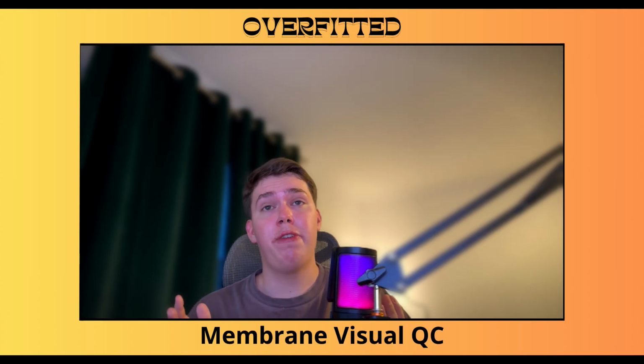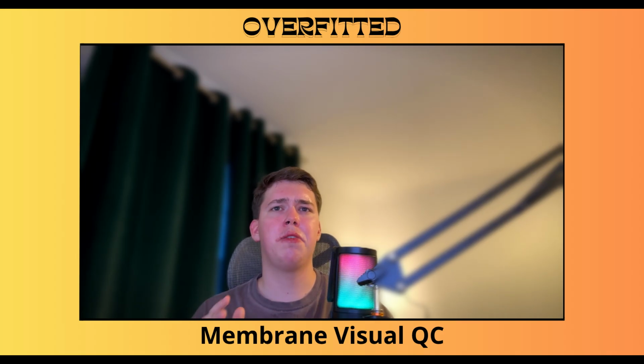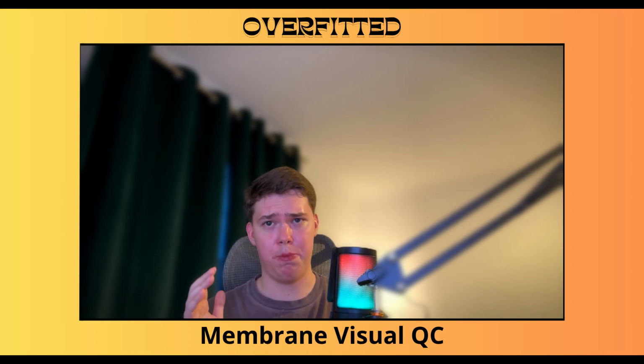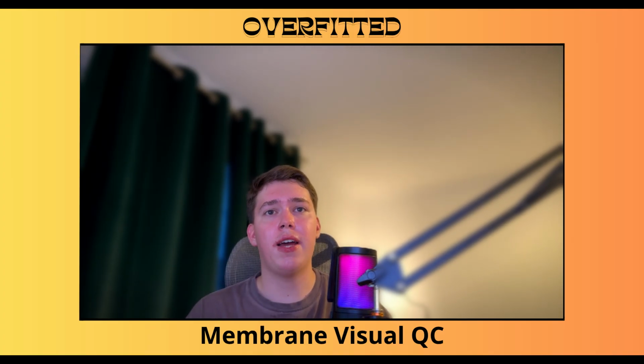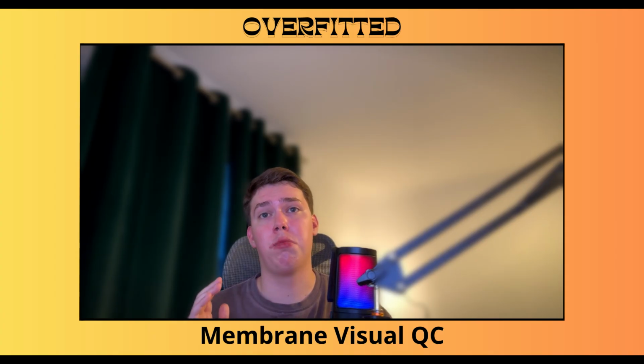So that's Membrane Visual QC 1.0. What started as a relatively simple PyMOL script turned into a much bigger exercise in structural bioinformatics, scientific provenance, software design, and reproducibility. The project is open on GitHub and version 1.0 is available now.